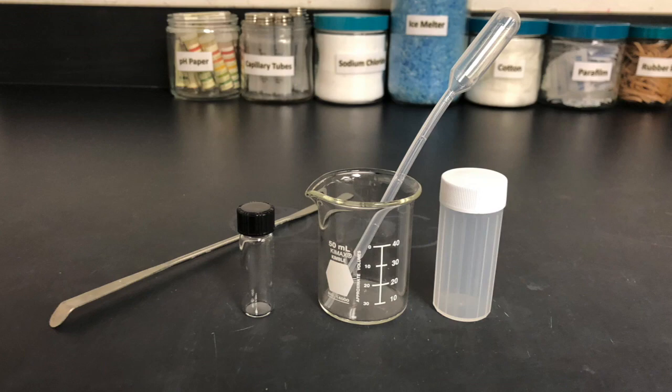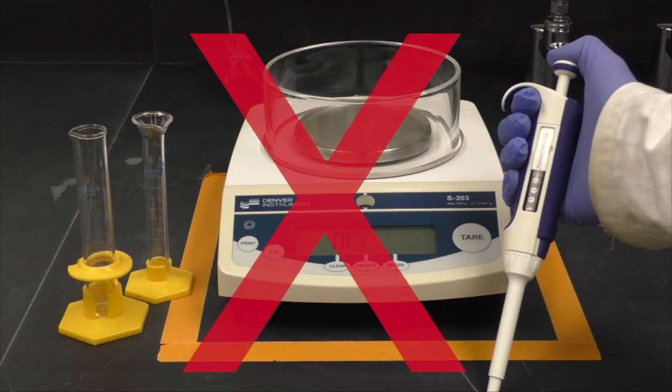When performing qualitative tests, it's important to use the correct equipment. You will not have to make any precise measurements, so don't use the balances, micropipettes, or graduated cylinders.